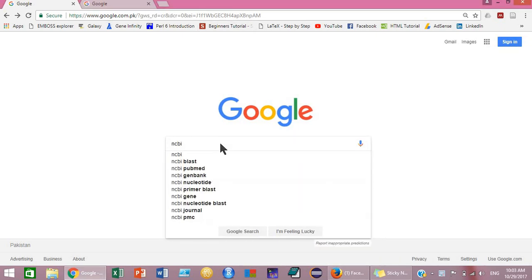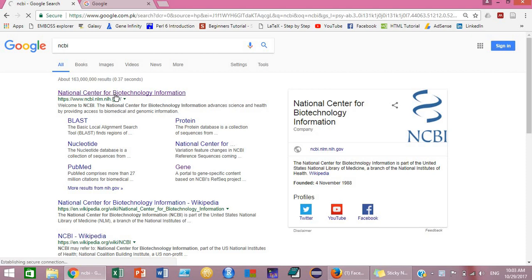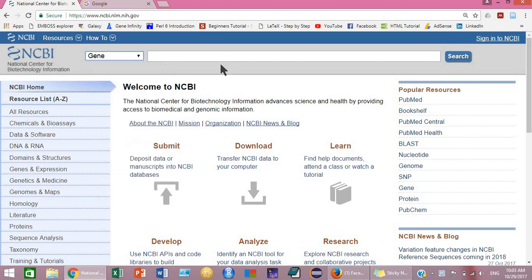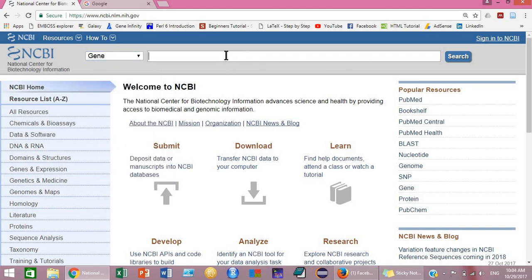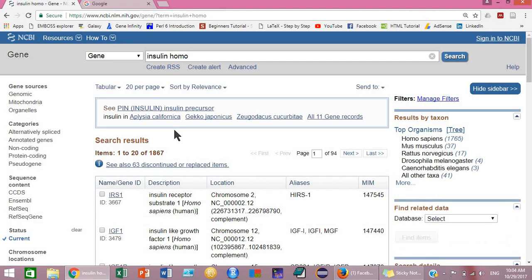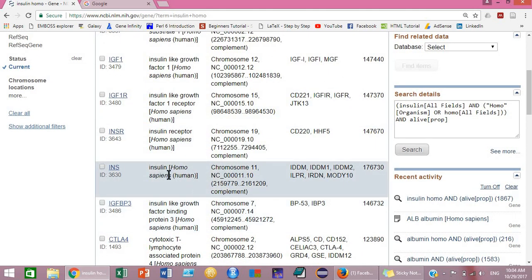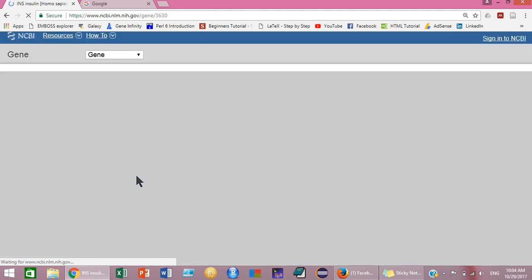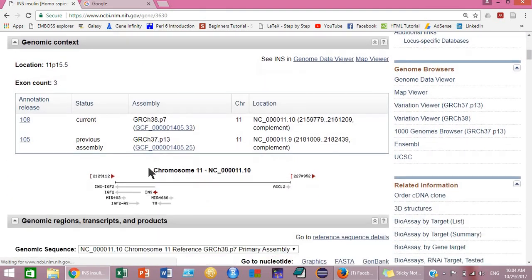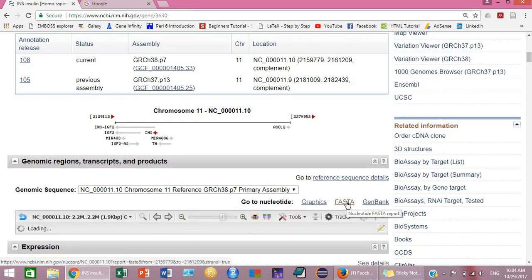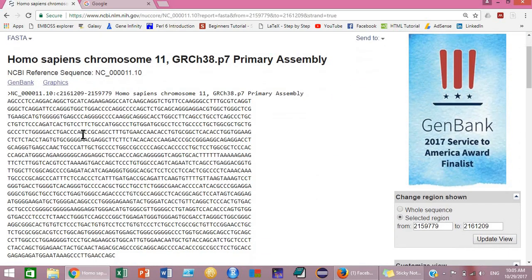Go to NCBI, select Gene, and search for your desired gene. Suppose you are going to design primers for the insulin gene — type insulin here, for Homo sapiens. This is the code for the human insulin gene, just click on it. Then click on the FASTA button to get the sequence of the gene.